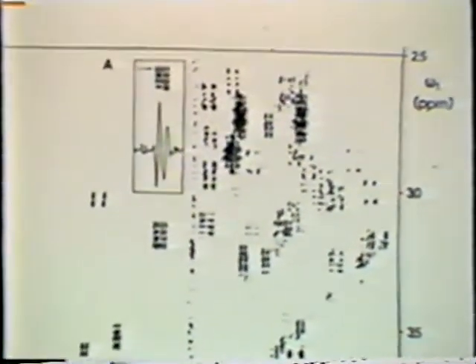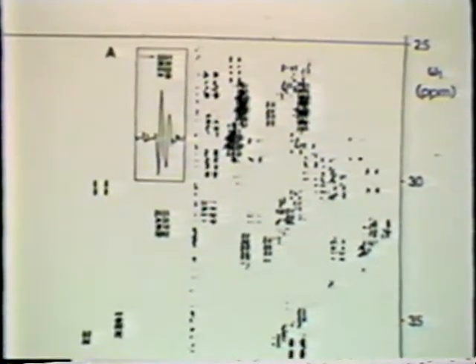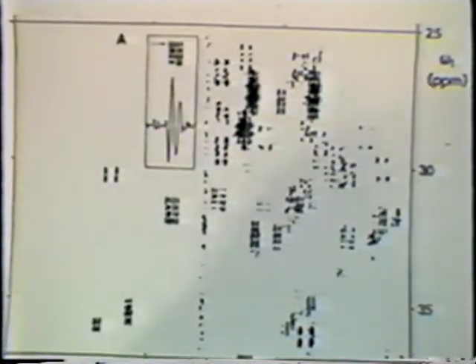So you can see that a pure absorptive phase sensitive spectrum has very high resolution and is extremely crucial. In fact, that's perhaps the difference between the first half of the 1980s and the second half of the 1980s, the phase sensitive plot.